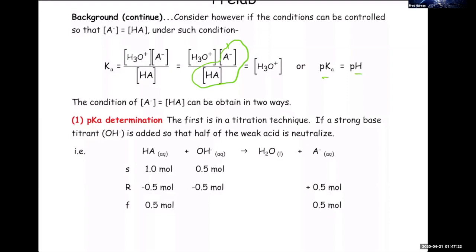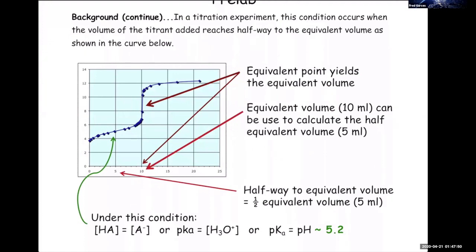You already know that because we did that in experiment number 4. When you reach the equivalence point, if you look back in your titration curve and find the volume halfway to the equivalence point, then that pH equals the pKa. Here, it gives you the ICE table for that particular calculation, and it shows you how the chemistry works out. And then here it tells you how to read your titration curves so that you get pertinent information. Let me just comment on this.